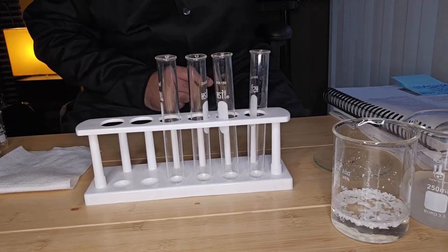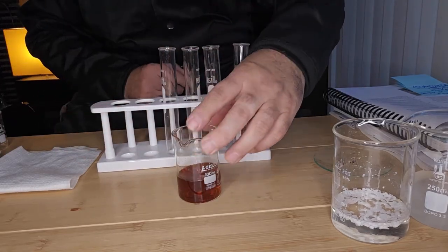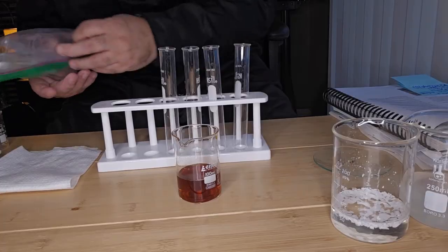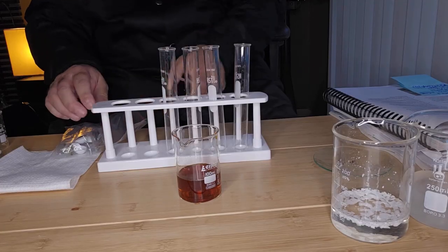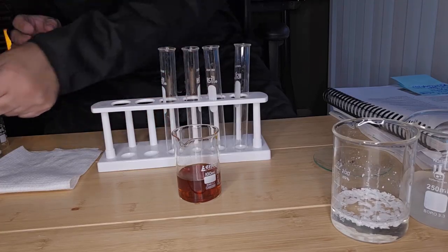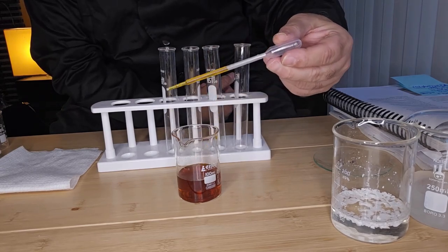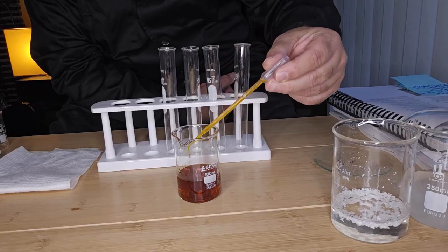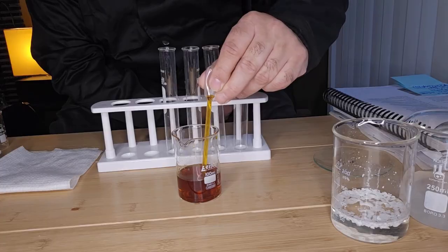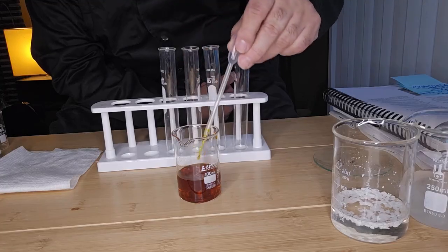So I've got my ferric chloride solution here. And if I get a pipette, let's just take a look at the color of this solution. As you can tell, it's a brown yellow solution to begin with. So that's ferric chloride, and it's a clear solution.